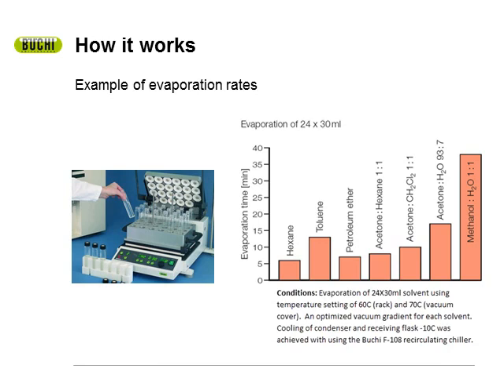Like I said earlier, using pressure speeds up the throughput. Here's an example of different evaporation rates between different samples, and you can see the speed of it is very, very attractive. Start off with hexane. 30 milliliters of hexane is actually evaporated off in 5 minutes. You jump up to the very far end on the right, you see a methanol and H2O mixture, a 1-to-1 mixture of 30 milliliters. And you can see that took about 37 minutes.